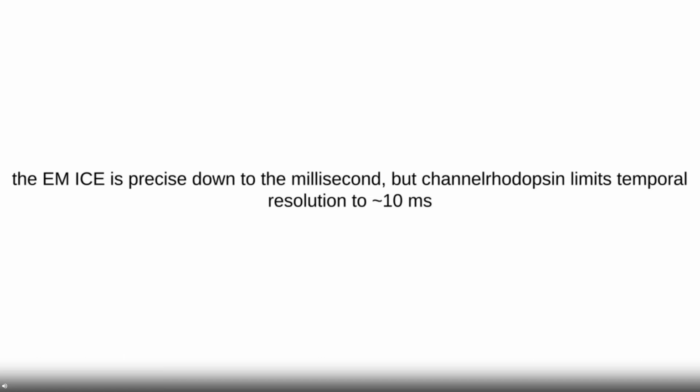And that's because while the high pressure freezing, as I said, is extremely precise down to about the millisecond, channelrhodopsin itself as a tool has a lot of limitations and potential artifacts you introduce. The most relevant one to this being that your temporal resolution is somewhat limited. I said we had to shine a light for about 10 milliseconds. The action potential can fire any time within that 10 milliseconds and even afterwards. So essentially, we're limiting our temporal resolution down to 10 milliseconds. So within all those precise, delicate events that are happening over the course of milliseconds, we really could be missing those with this technique.